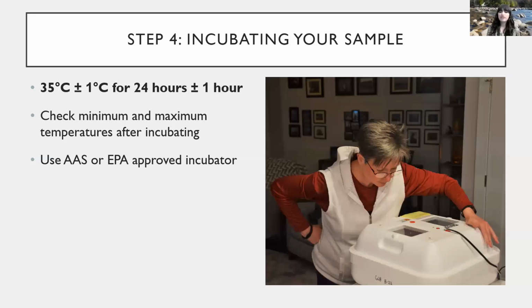You want to make sure to check the minimum and maximum temperatures after you incubate them, because you want to ensure that your incubator didn't go outside that range of 34 to 36 degrees Celsius. So that's why we recommend that you get to know your incubator, just in case it's a little temperamental and you're going to have to continuously check on it to adjust the settings or the temperature.